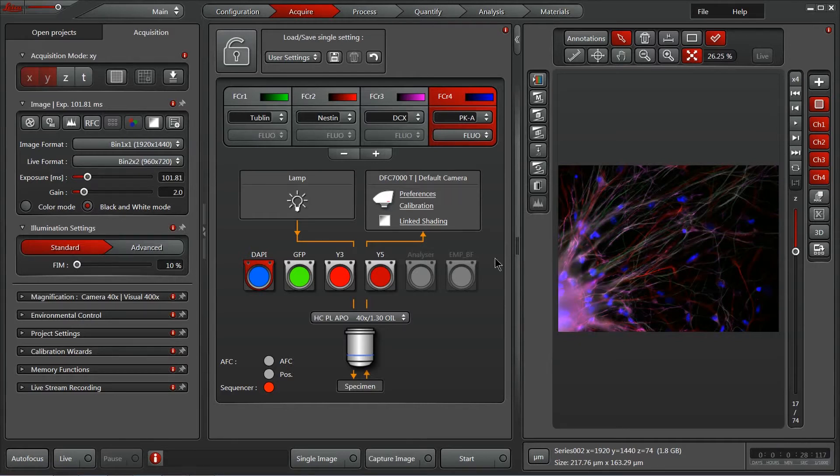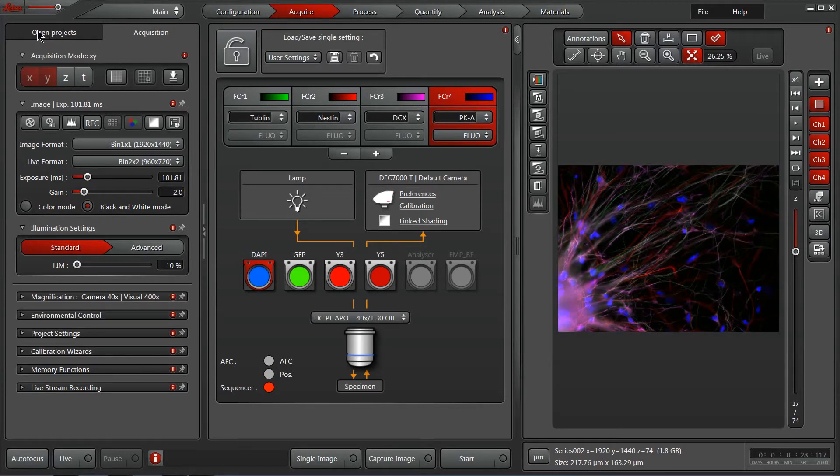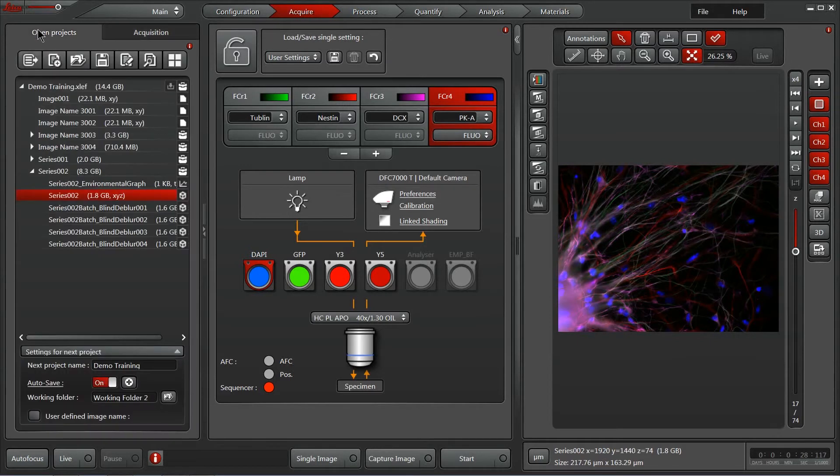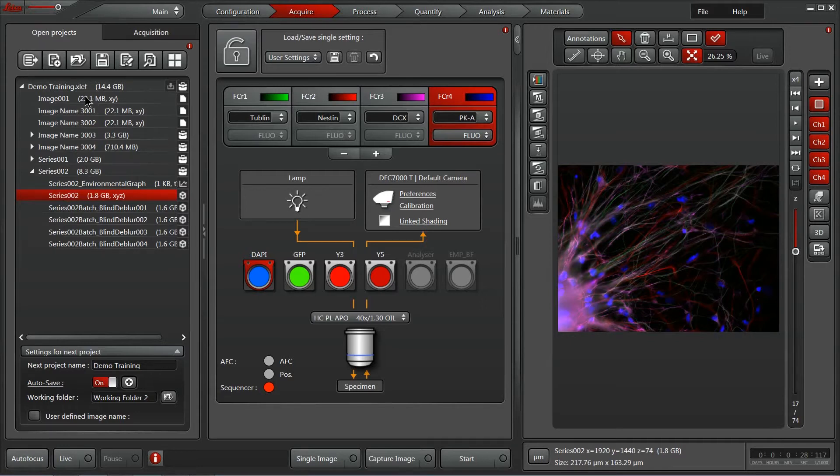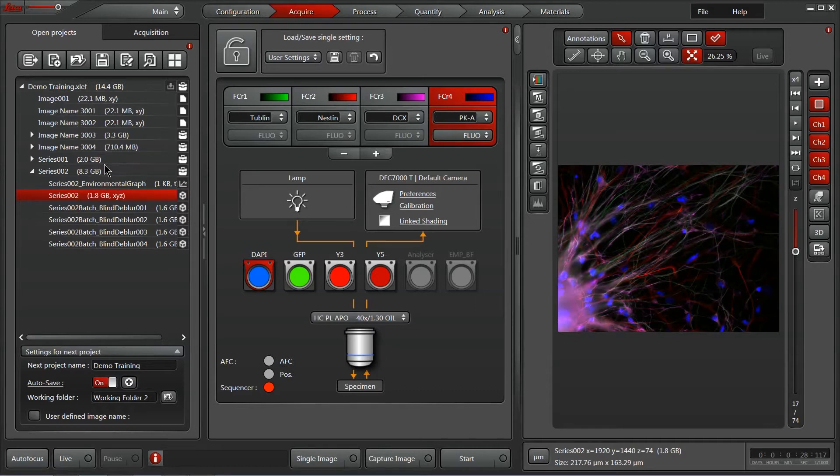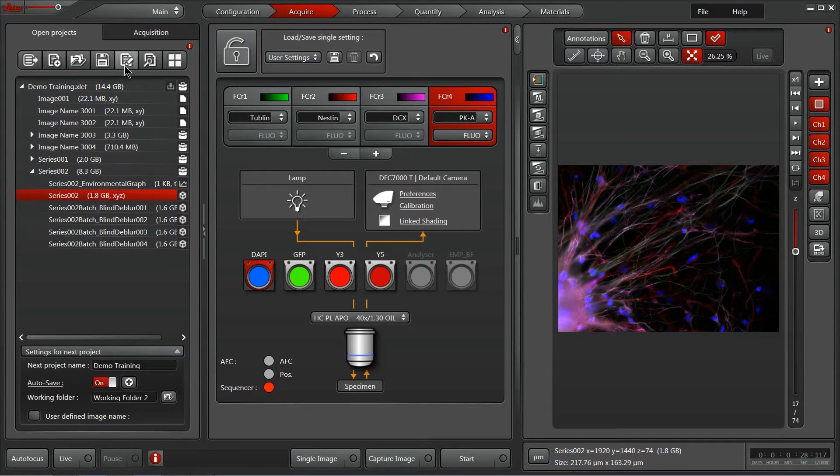All allow you access to different things very easily within our software. Starting with our Projects tab here, this is where you can navigate through acquired projects or open new projects. A project is simply a collection of images or experiments. You can even select an experiment and apply the settings from that experiment to the microscope as a way of quickly reproducing experiment parameters.